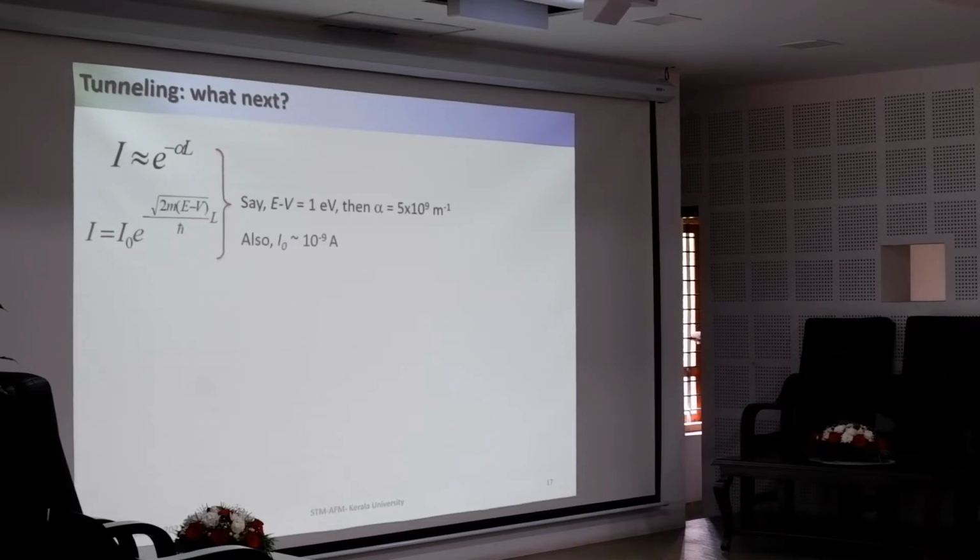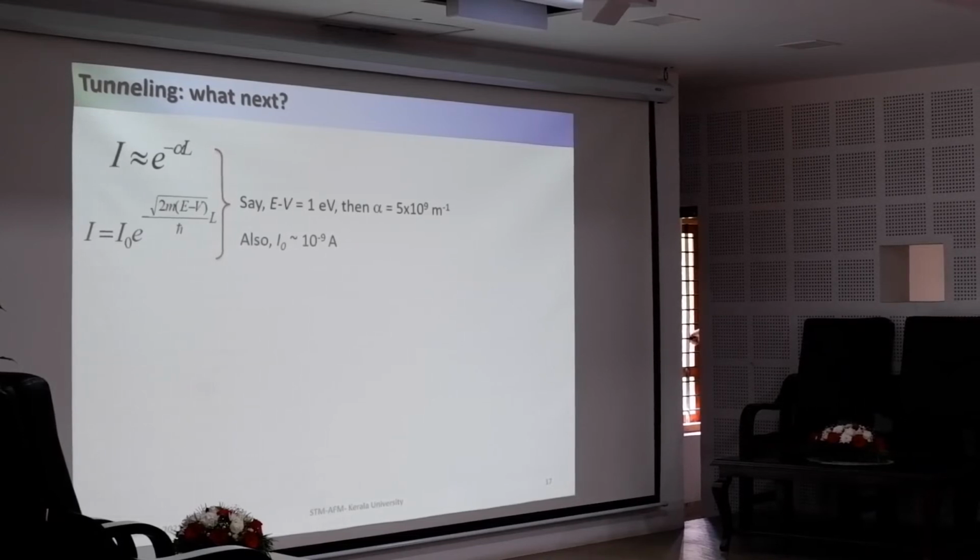That's called thermionic emission. So some noise will be there. If I take that noise as 1 nanoampere, it's huge, but for STM it is a huge noise. Suppose I take these values, 1 nanoampere here.